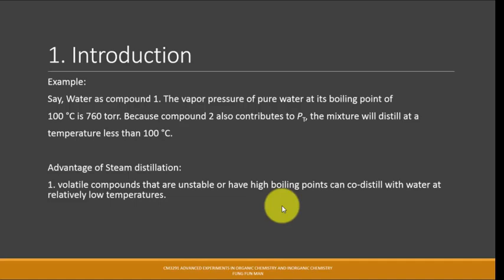And the second advantage is you can avoid the decomposition that might occur at the normal boiling point of the compound of interest. Because now you're changing it from a liquid to a steam first, right? That's not breaking any covalent bond because it's just a physical change. Then you can collect your pure compound by condensing it back to the liquid state.